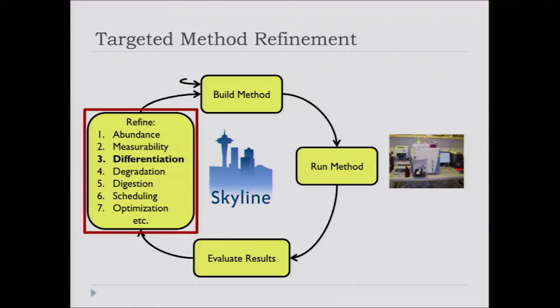assay where what we're interested in is deciding which of the targets have any hope of giving us a differentiation. Since the MacLean lab is not as wealthy as some other labs, we frequently are doing label-free and don't buy a lot of synthetic peptides.